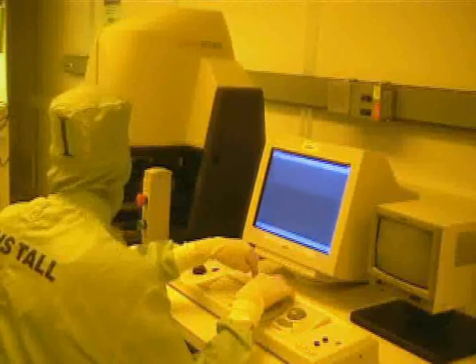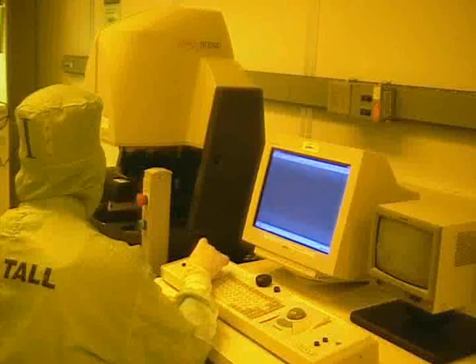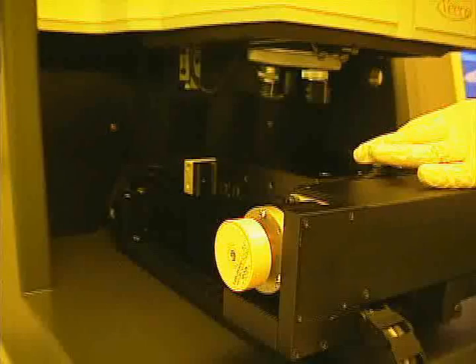To remove the sample, rotate the focus knob to the right. Move the stage outward by pressing up on the joystick and remove the sample.